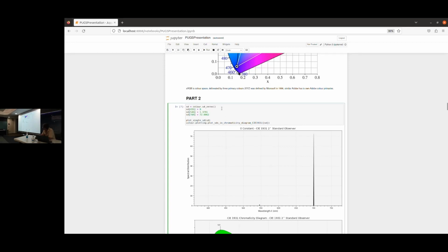So it gives us a way to just create artificially a spectrum. So it's an array of data from 380 to 760 with numbers, and it represents wavelength and amplitude of that particular wavelength. So in this case, I have synthesized with some weights over here.